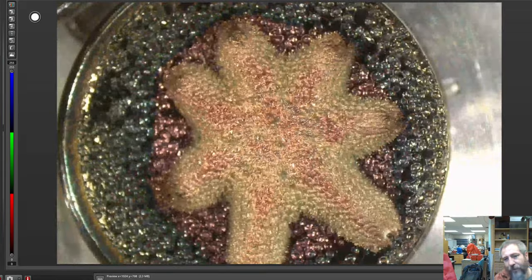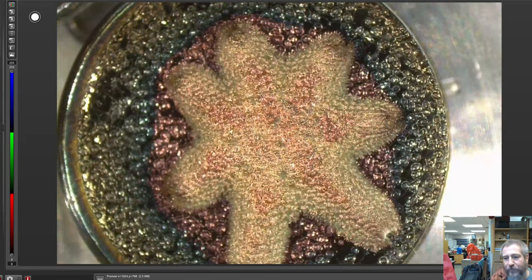You can see that right now if you look at the edges out here, they're really out of focus. If I make this part in focus, and then I can kind of get the edges in focus, I lose this thing. But in the SEM, because we're using electrons, not light, and we're often imaging these things from very far away with respect to how electrons see them, we can actually get a lot greater depth of focus.